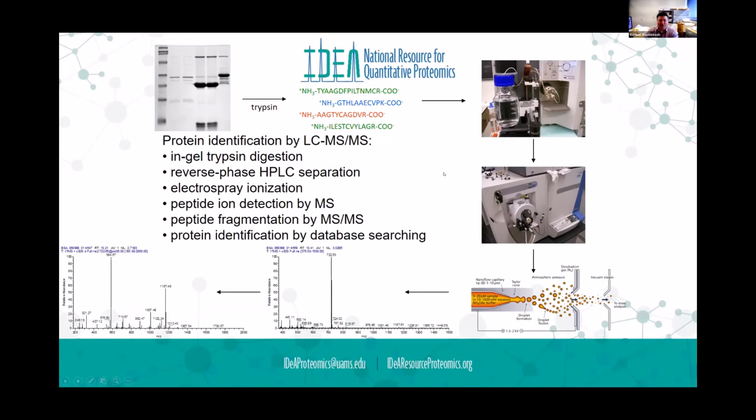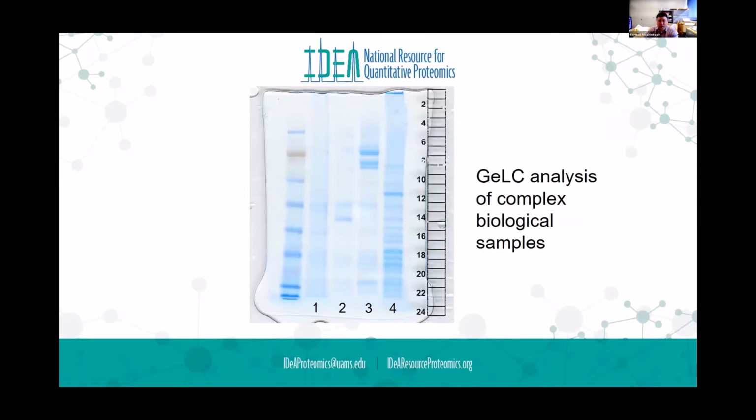So this is a recap from yesterday. Once you get the sample, you fractionate, separate, deplete, whatever it is, then it goes through this whole LC-MS-based system to identify proteins and peptides. We went all through that yesterday in the protein and peptide ID presentation.